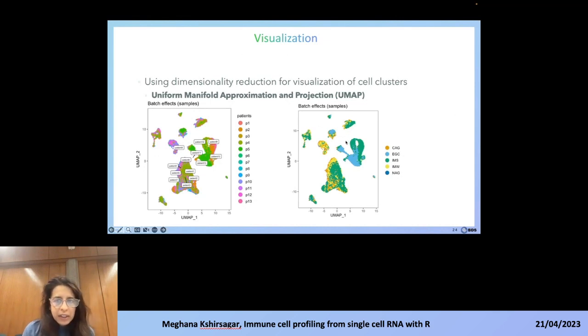We can see on the right hand side also, we had 5 categories. If we look into each of those cell clusters, we can see that some of the bigger clusters have cells coming in from a specific group, rather than cells coming in from all of the groups.